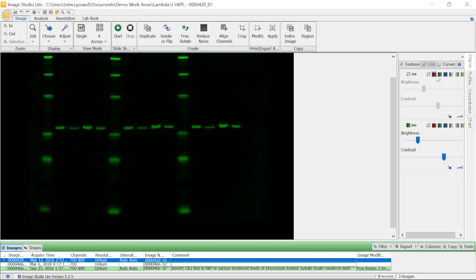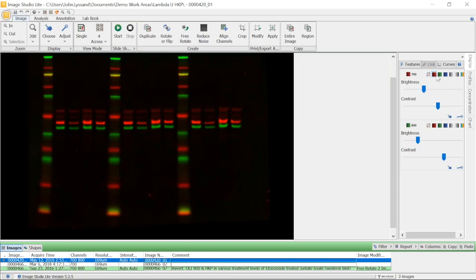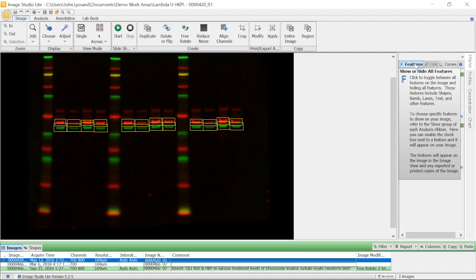This Western blot was imaged on an Odyssey imager and then imported into Image Studio Lite. After importing, we've already gone ahead and quantified our bands of interest. Now, to recap the basic features of how to quantify your targets of interest, especially in Image Studio Lite, please make sure to review the lessons covering basic quantification. Once you've quantified in Image Studio Lite, we'll next want to export our data to a graphing program.